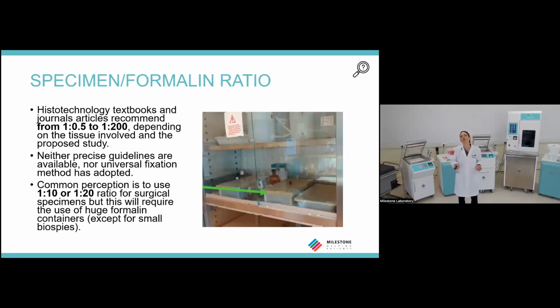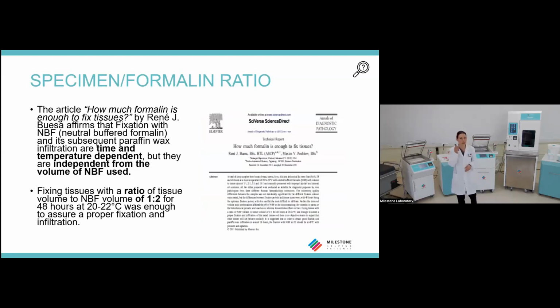If you really want to apply the 1 to 10, they should use not plastic containers, but a big bucket. I have reported for you an example of these containers that I found in a hospital in Switzerland, but this is really not the reality, because the buckets are more practical. It's not possible for a surgical specimen to use containers so big.